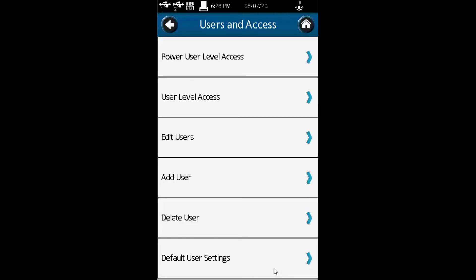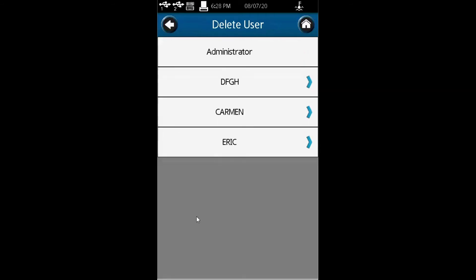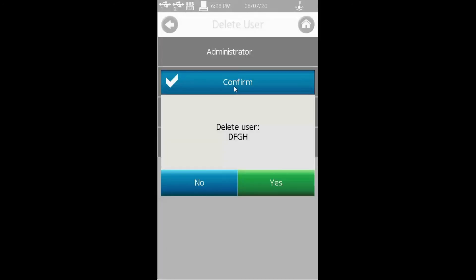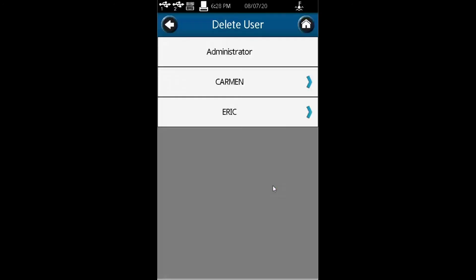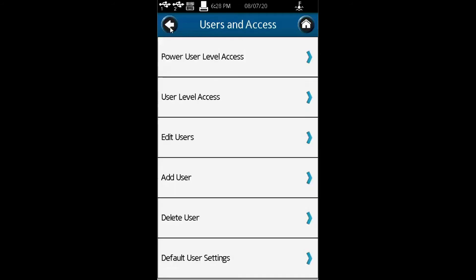As you can see, you can go back and add users, edit users, and delete users. For example, I can delete this person here. Delete DFGH. Yes. It's been deleted. Now there are only three users.